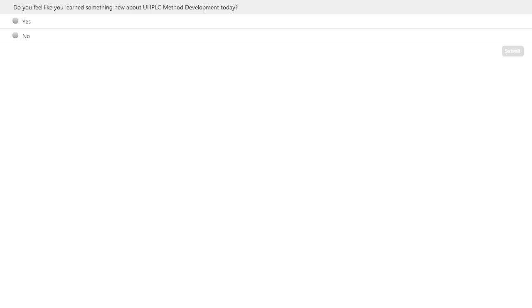The only thing I would consider is if they're quite large peptides that have any secondary structure, because then you might see some differences. So it will depend on how big the peptides are, but it should in theory translate well. We've also done it for coupling columns together. So we've translated methods from 1 column to 3 columns in series for protein digest, so peptide mapping.